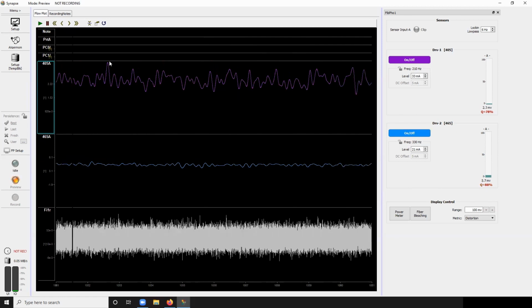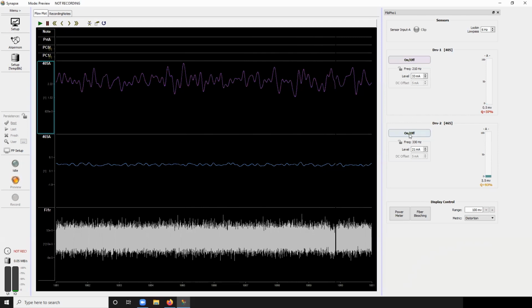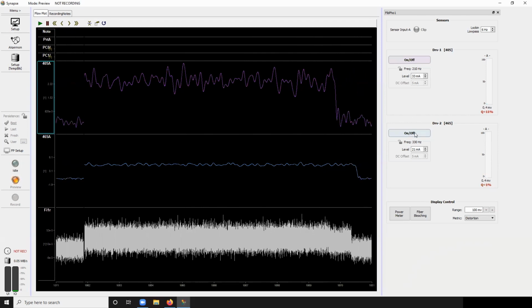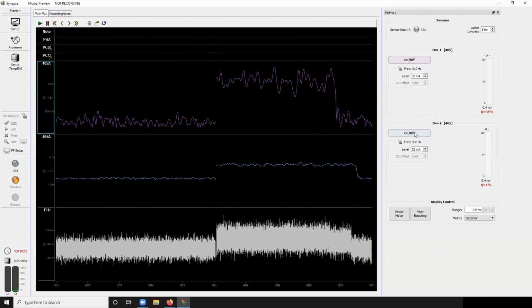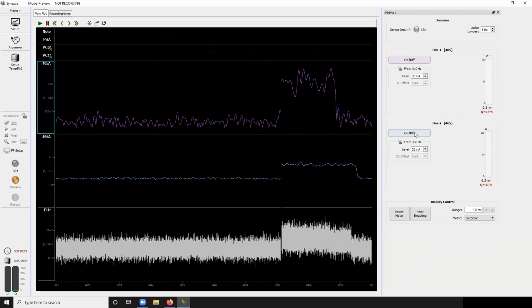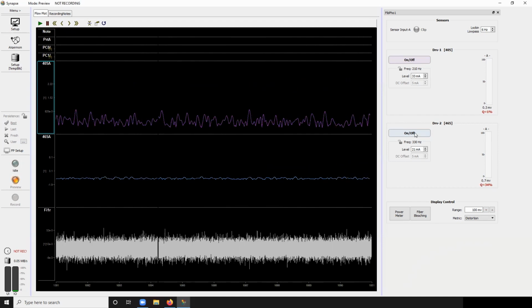What we're going to do is we're going to get a piece of paper, scribble some highlighter on it, and then we'll watch the signal change. So what we want in this highlighter test, which is a silly little benchtop test, but it's helpful, is a surface that's black, a white piece of paper, and some yellow highlighter. So scribble maybe a strip of yellow on the white piece of paper.